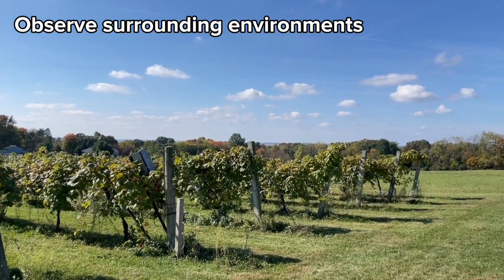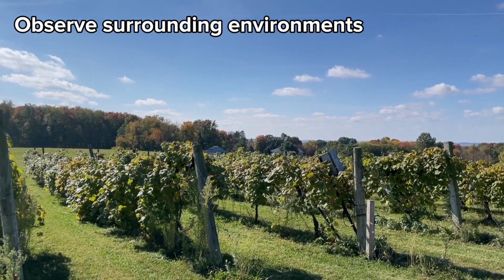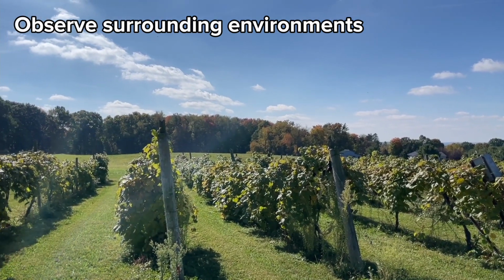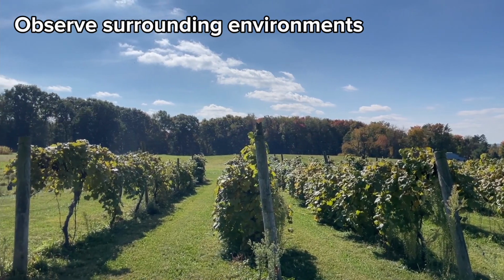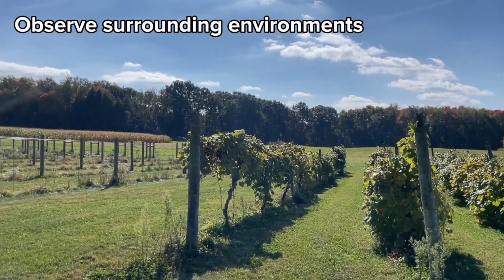After arriving at the field, check the surroundings. The environment near the field can provide valuable information because the pathogen may come from nearby areas. For example, a forest close to the field could introduce pathogens. If the pathogen has multiple hosts, it might also come from another nearby field.